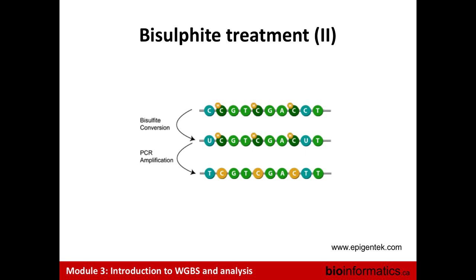probes. So this is an example down here where these Cs are methylated, so it leads to this sequence. So you could have a probe associated with that sequence, and you're basically measuring that probe versus an unmethylated probe that would have these Cs converted to U's and then to T's, right? But you can see how, especially if you have just one C, that's relatively simple. If you have multiple potential methylated Cs in the neighborhood, then you have to design your probes carefully to be able to detect the different types of scenarios.